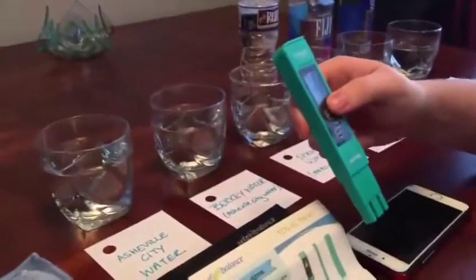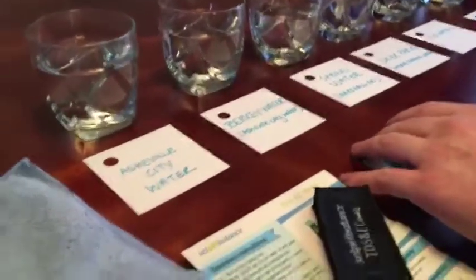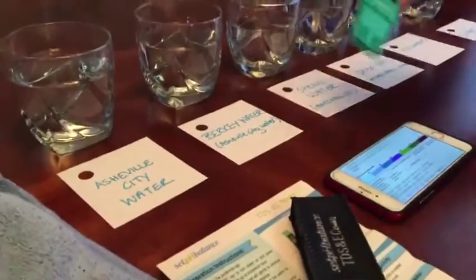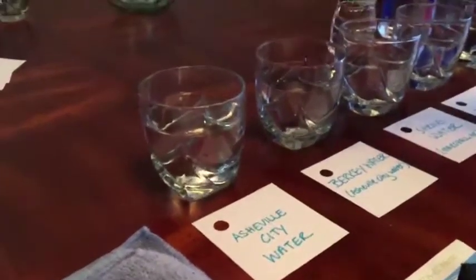So now we're just going to go ahead and we're going to do it. Let me get my chart up. I just got this chart from TDSmeter.com. It's an EPA chart. This is Asheville City, Asheville, North Carolina. Acceptable ppm rating is 0 to 50.